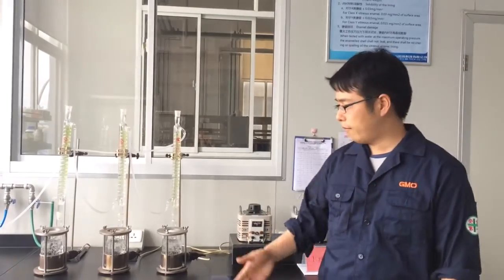And the second is the acid resistance, it should be accurate. And the third is the enamel dissolution rate, and you can have a look here.